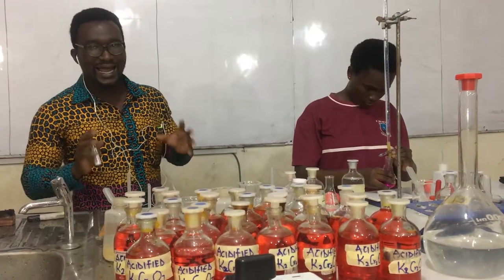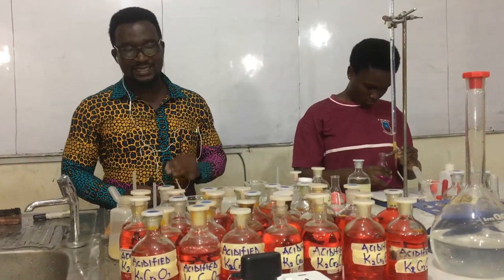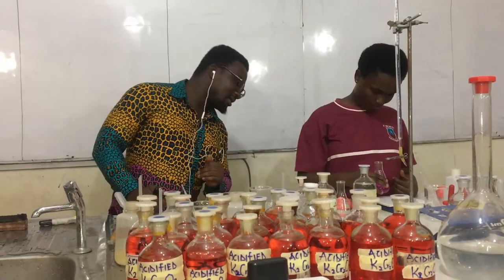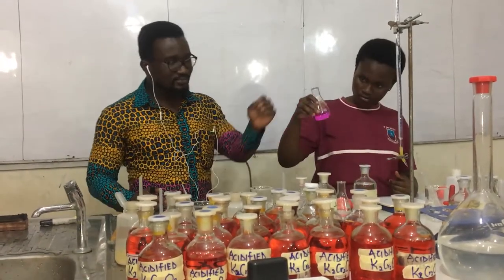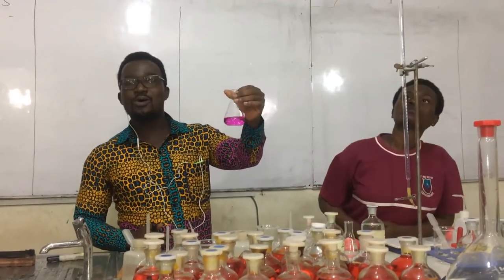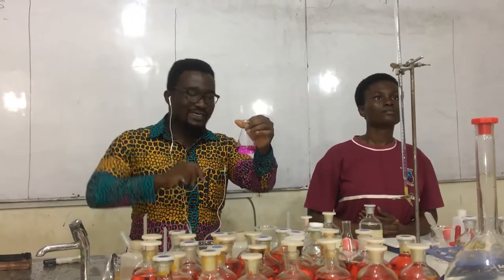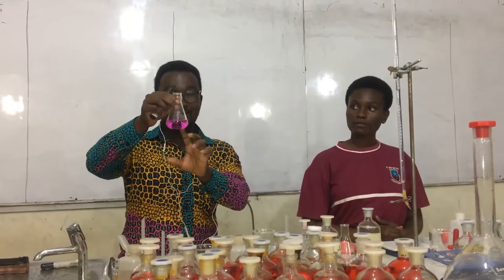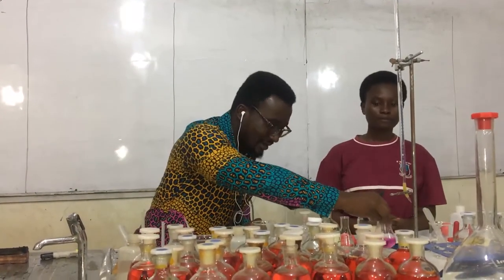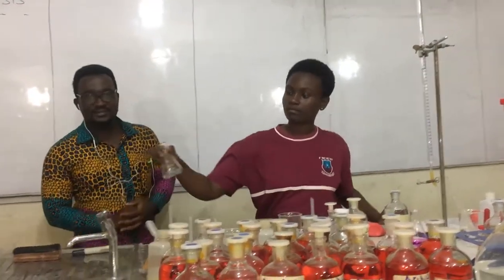You are also to note the color of the indicator before we started the titration. Before we started the titration, we realized that the color was pink. Good. Now, this is the portion we have approached, almost closer to colorless. Almost closer to colorless. We will discuss the effect while you still see the color as light pink. We'll discuss that one. Thank you, madam. You can continue with the second one for us.